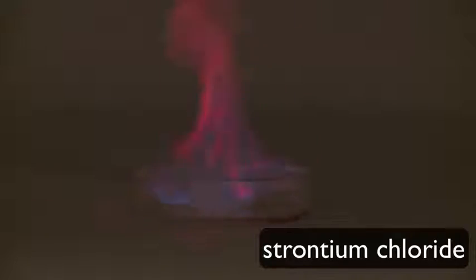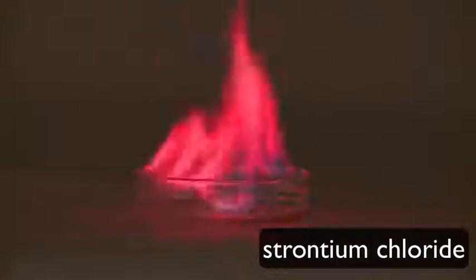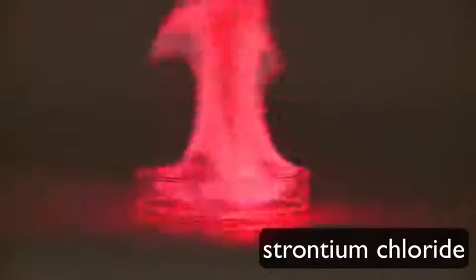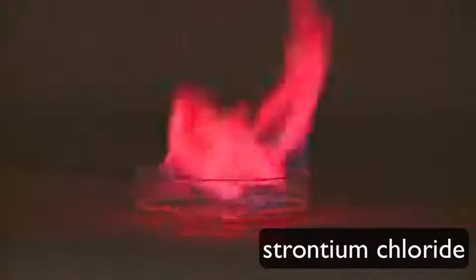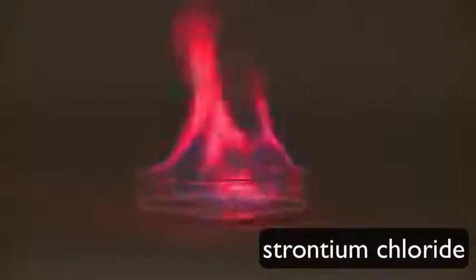The next solution is strontium chloride, which emits a bright red color. Does the emission of red light involve a higher or lower energy photon than the emission of purple light? Go ahead and try to answer that question now. Hopefully you said that the purple light was a higher energy photon. The purple light has a smaller wavelength, which corresponds to a higher frequency and a higher energy than red light.